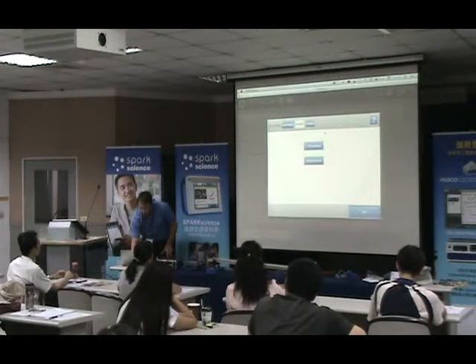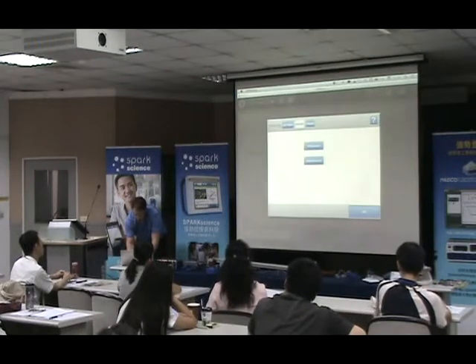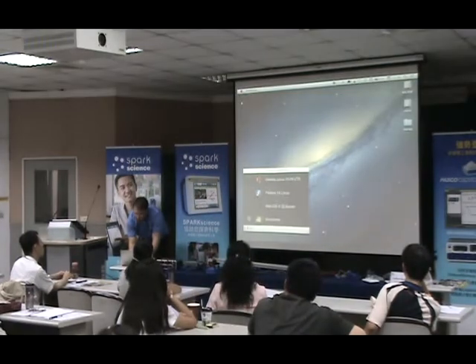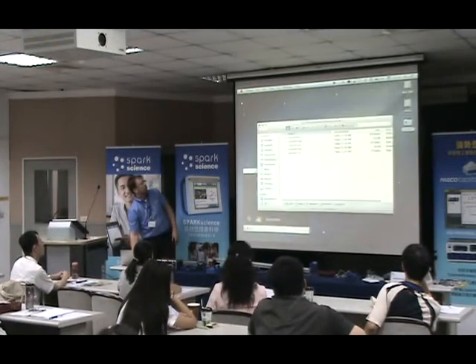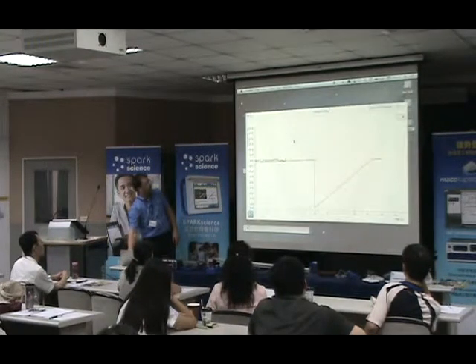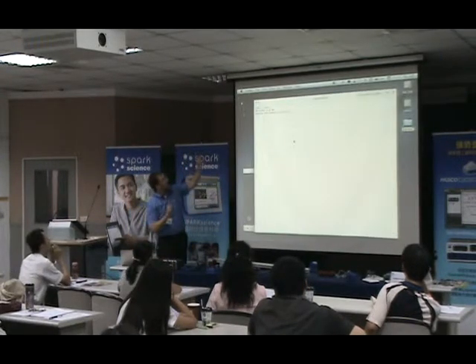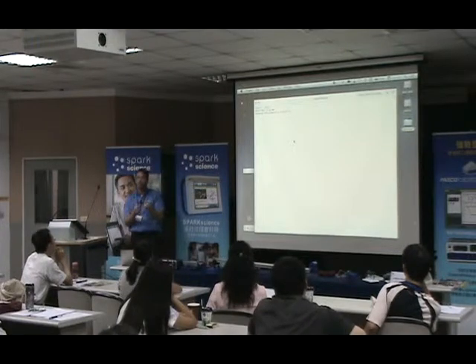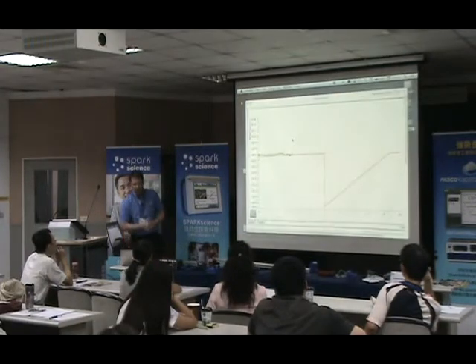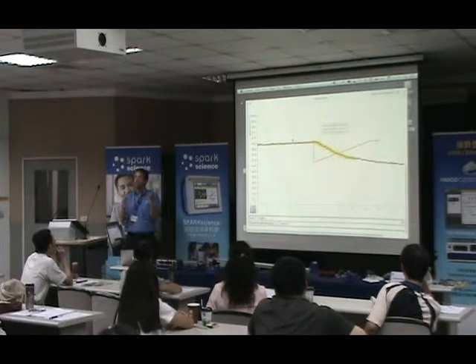So I'm going to go ahead and save my journal to my desktop just to show you what it looks like. Okay. So there's my journal in a folder. All right, so you see inside of this journal, I have all the original pictures. So I have all those screenshots that I captured earlier. I have these text files, and the text files have this time and date stamp, but they also have all those notes that the students type, okay? And more importantly, it all gets wrapped together in an HTML file. So in this HTML file, it takes all my images and my notes, and it puts them all together.